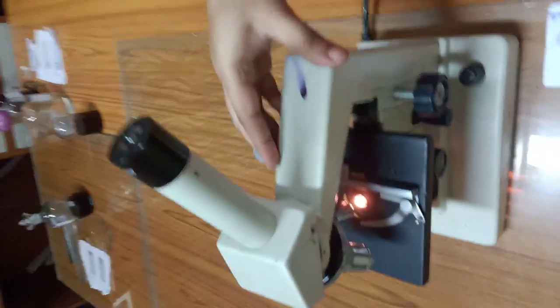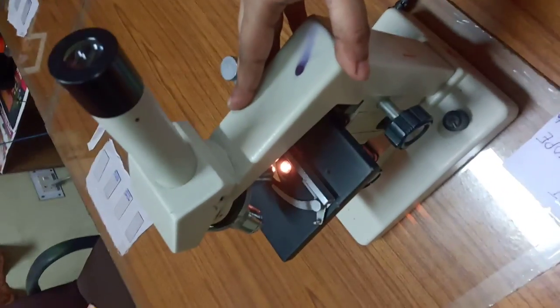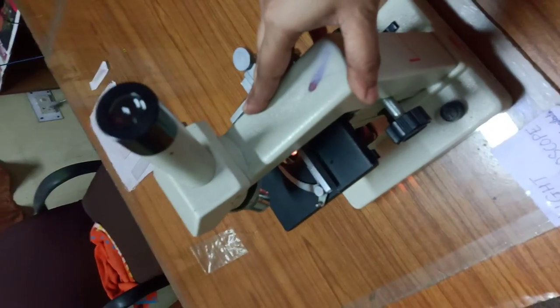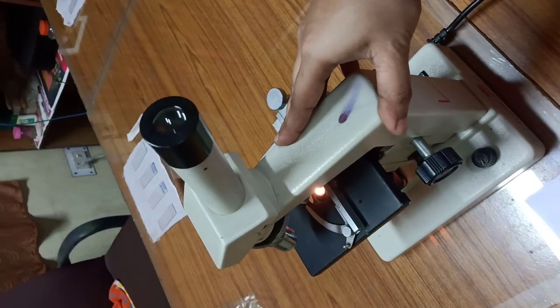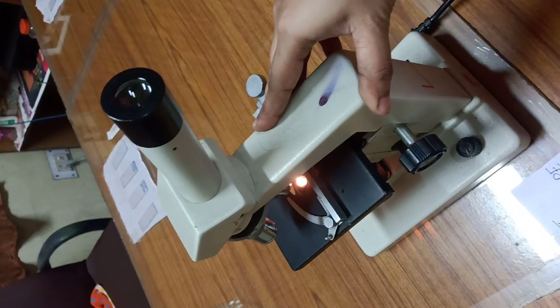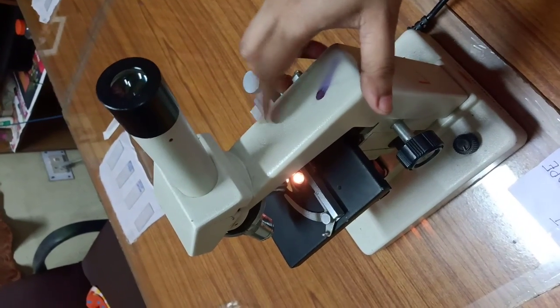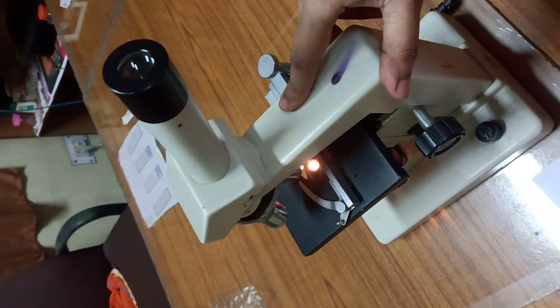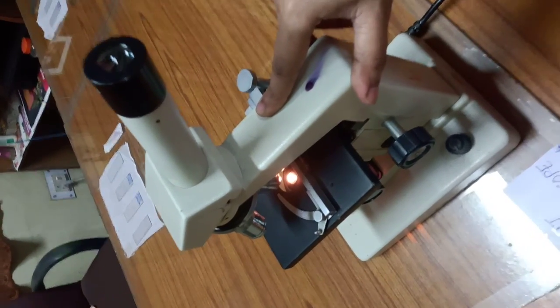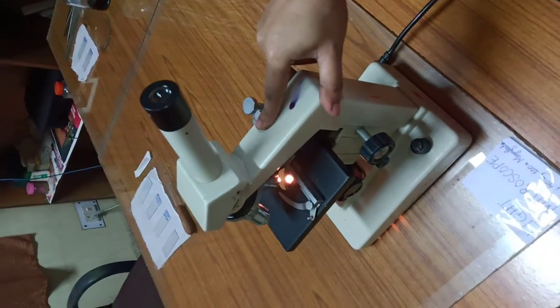The microscope that you are seeing right here is an instrument used to see objects that are too small to be seen by the naked eye. Microscopy is the science of investigating small objects and structures using an instrument. Okay, this technique is known as microscopy. And microscopic means invisible to the unaided eye.